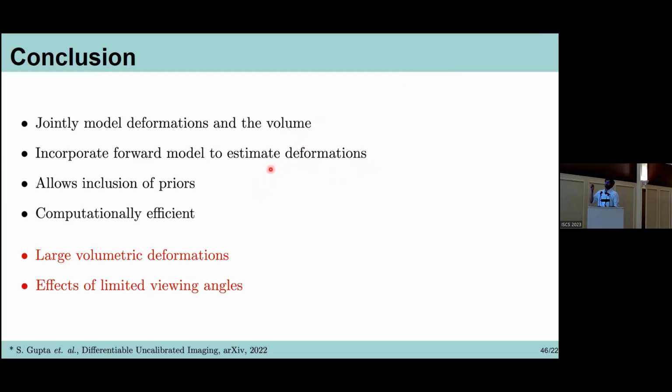So we take a single ray and we sample points along this ray. And I think it's not discretization, because we randomly sample points along this ray. So it's kind of continuous; we don't voxelize the volume.